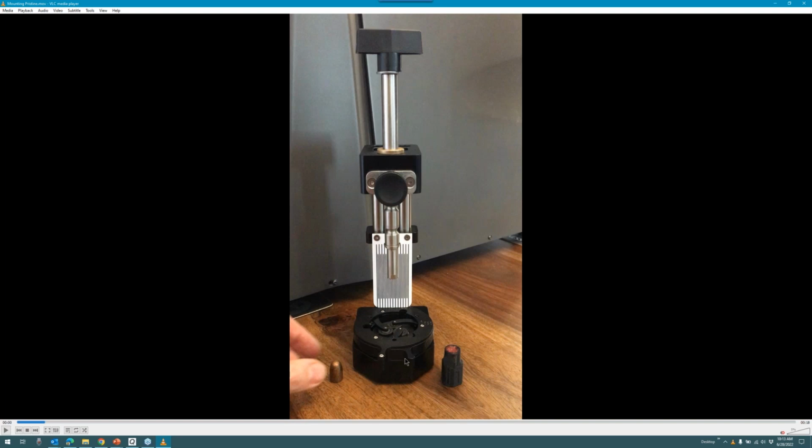So these 2 pincers here are going to get squeezed together. That is going to open up the clamp on the inside here where you've got 3 rubber contact points that are going to widen out and allow me to place the base of the bullet, base down, nose up in the center here. And as the clamp is released, the 3 contact points are going to automatically center the bullet underneath the shaft here. At that point, the stub is going to get mounted onto the shaft as well, and then it's going to get pressed where the nose of the stub with all that wax is going to get pressed into the nose of the bullet.